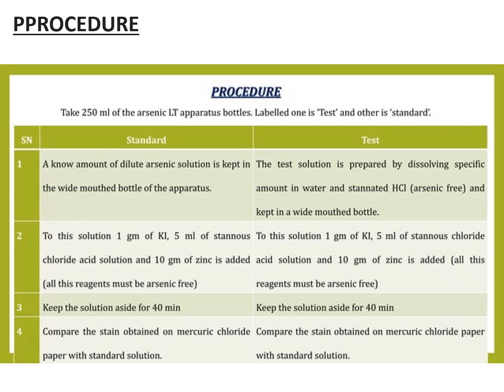This potassium iodide and stannous chloride act as reducing agents. That means the pentavalent arsenic acid is converted into arsenious acid. That is the purpose of adding potassium iodide and stannous chloride.